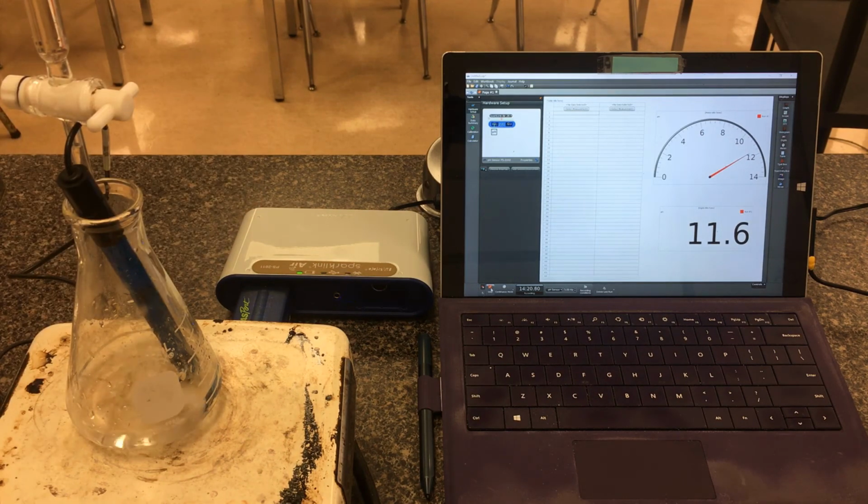Okay. So you saw us go up in 1 milliliter increments. There's nothing magic about the 1 milliliter. I just wanted to take down enough data points here so that I get a nice curve. Hopefully with those data points here, you can draw a nice smooth curve going through it, where it jumps from the last acid particle through a neutral solution to the basic solution here. It all happens within a very narrow range of pH. That's going to be your equivalence point here, and then you can practice your curve calculations shortly.